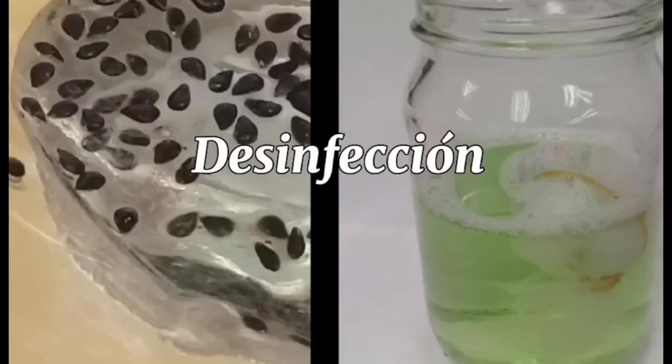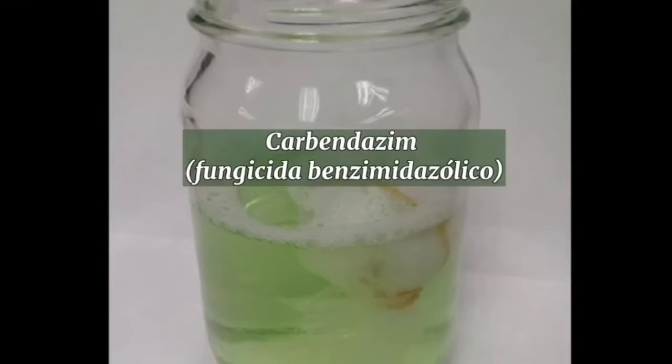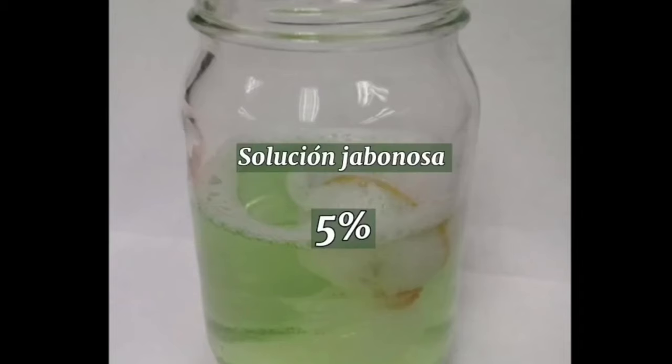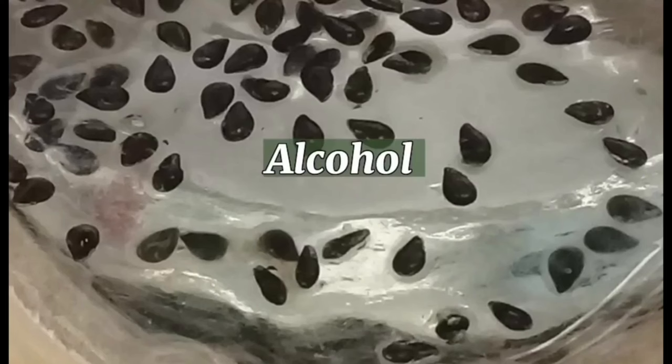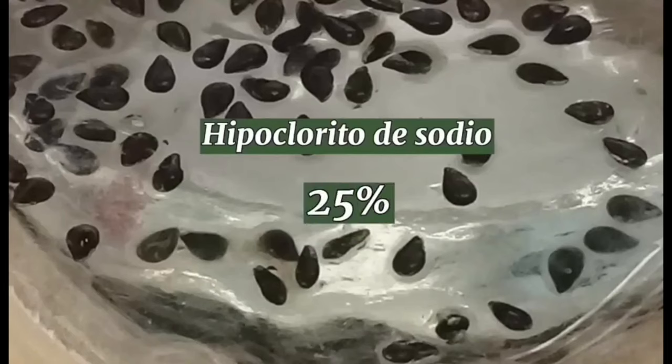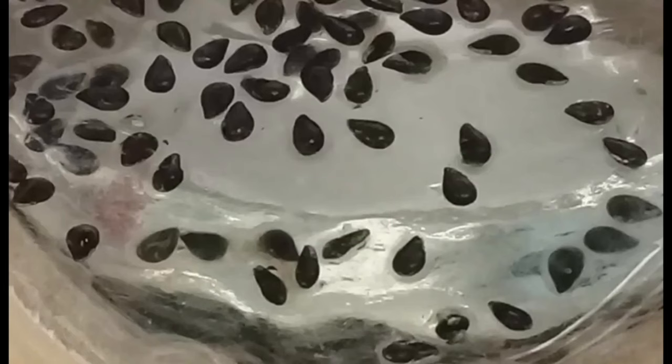Se desinfectaron las semillas en una solución de carbendazim al 0.2% durante 15 minutos. Posteriormente, una solución jabonosa al 5% por 12 minutos, seguida de alcohol al 96% por 1 minuto. Finalmente, una solución de hipoclorito de sodio al 25% por 18 minutos y tres enjuagues con agua destilada estéril dentro de la campana de flujo laminar.